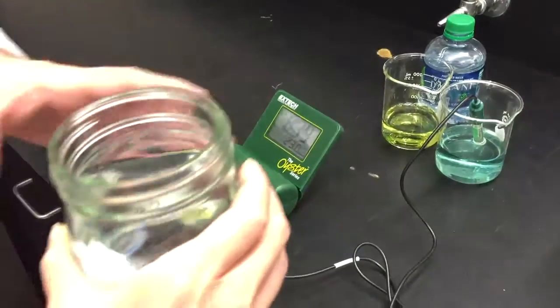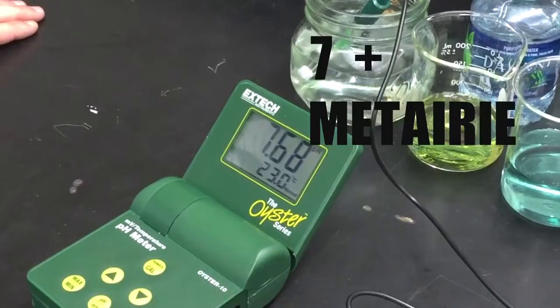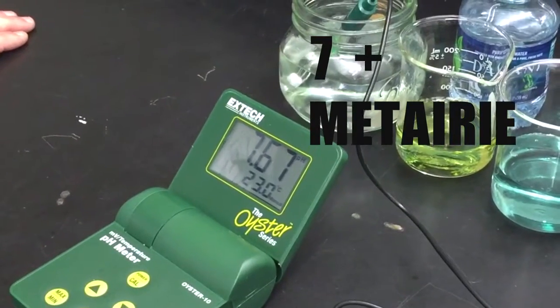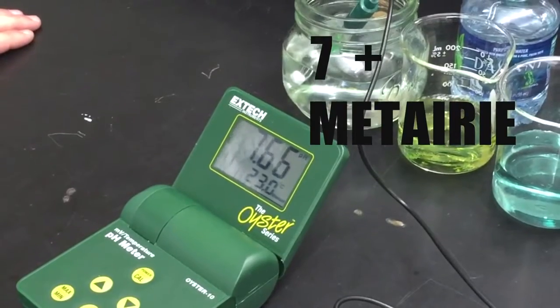And then I've got the Metairie water — let's see what this is. We're seeing that Metairie and New Orleans East is still alkaline, but just not as much, at about 7.66, 7.65.